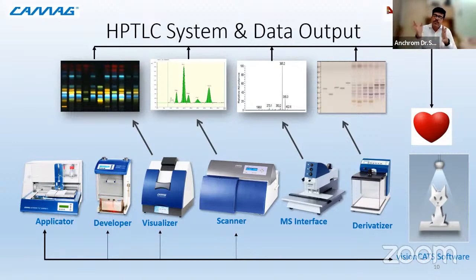And in this ADC2, we have a device known as the humidity control, which has this salt solution inside. So secondly, first, when you finish the application, it dries the surface, removes the excess moisture, and then it does the plate development autonomously. The solvent pours into the chamber, the plate goes inside, the development happens, the separation happens, and the moment the solvent reaches a certain level on the stationary phase, it identifies with the help of its sensors and tells the system that now the plate is being developed.